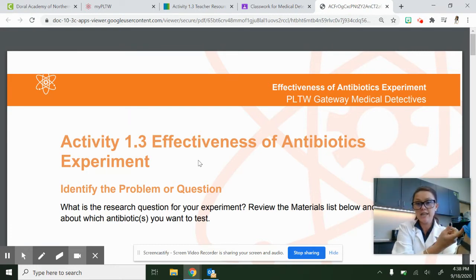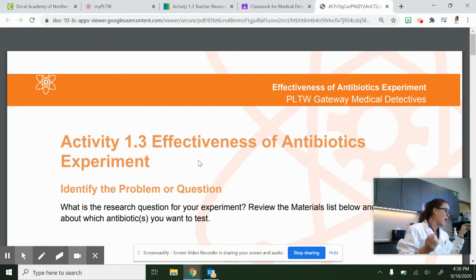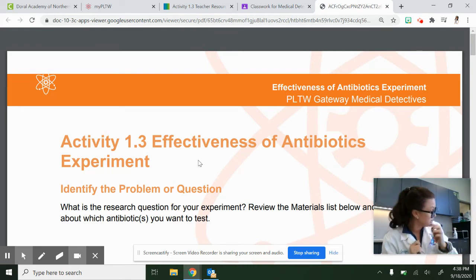And then underneath here where nothing has been touched, then you can, let me get back on the camera here. Then you're going to pull that up, okay? So now everything is contained into your gloves and you never had to touch them, okay? You can practice that skill, okay? And then you're going to throw it away and then you're going to go and wash your hands.